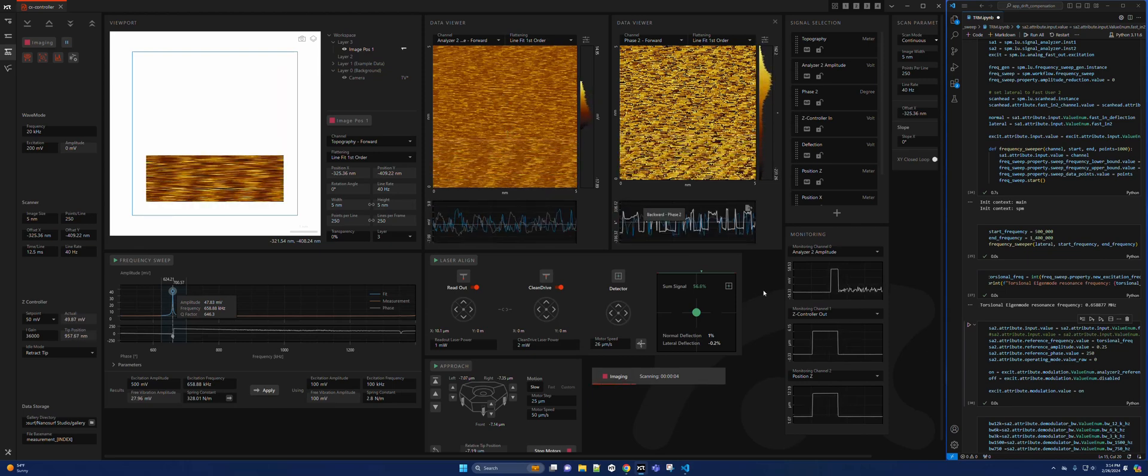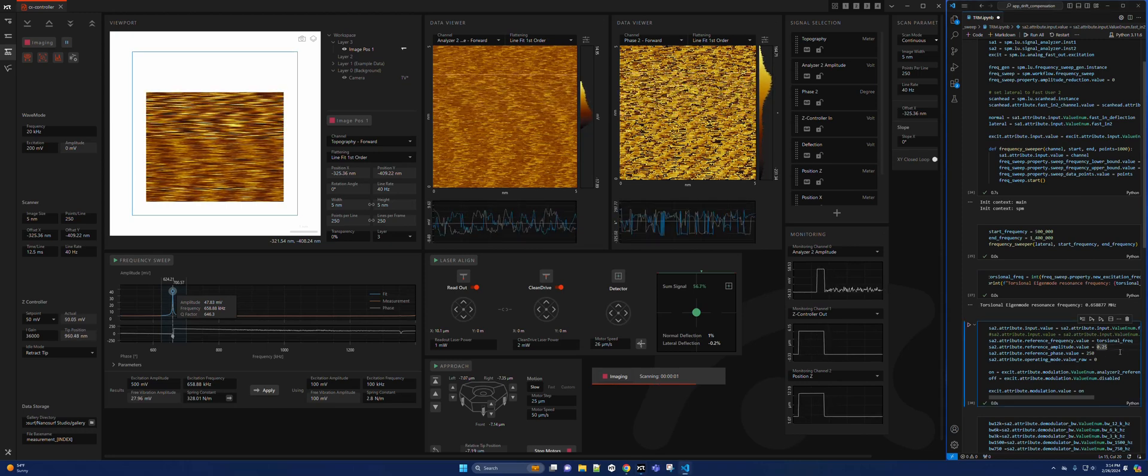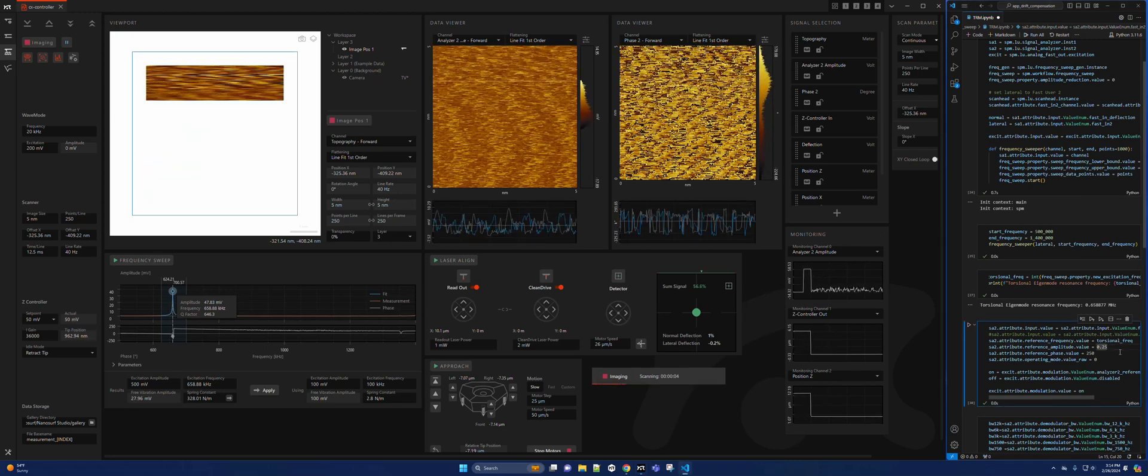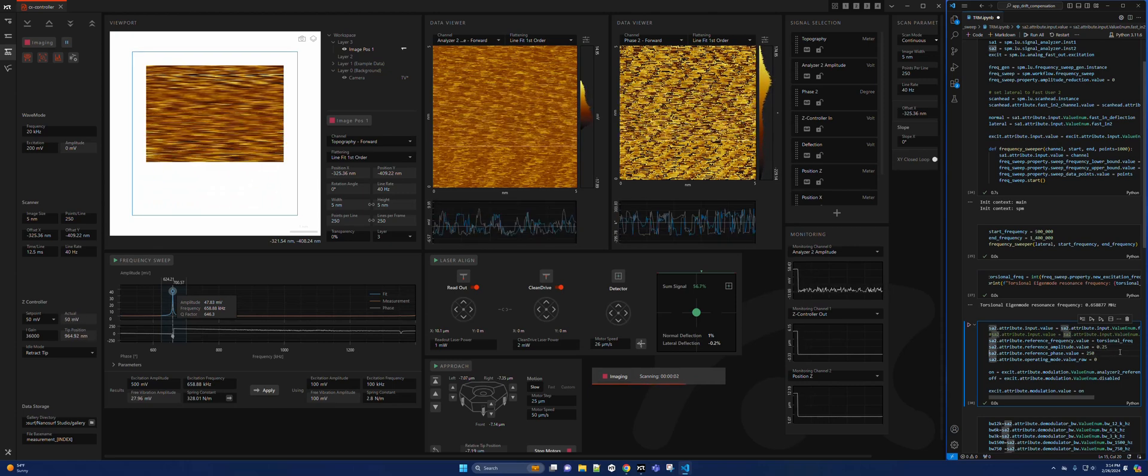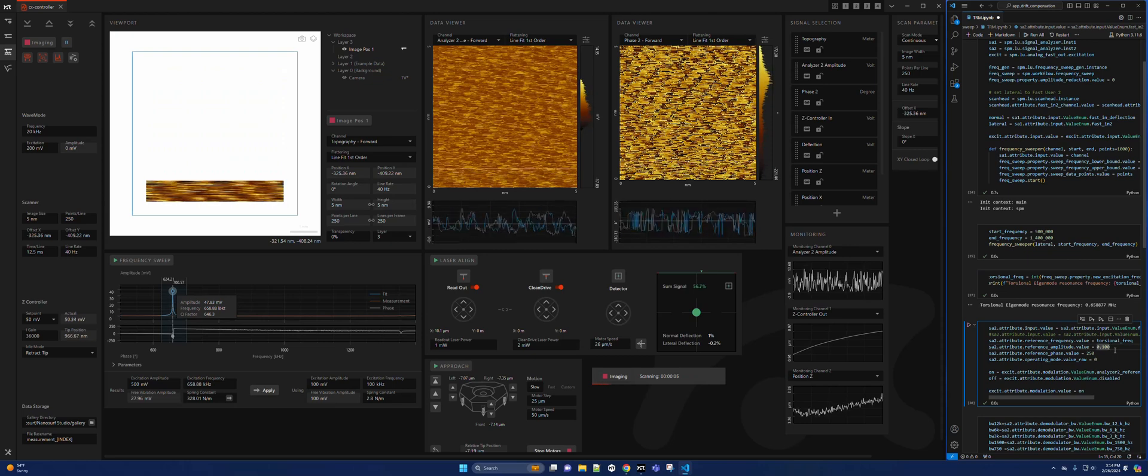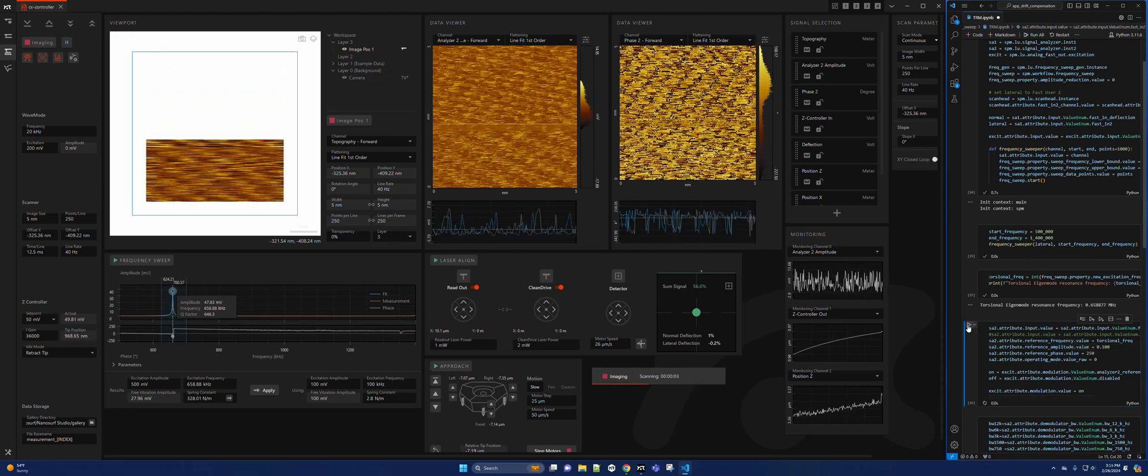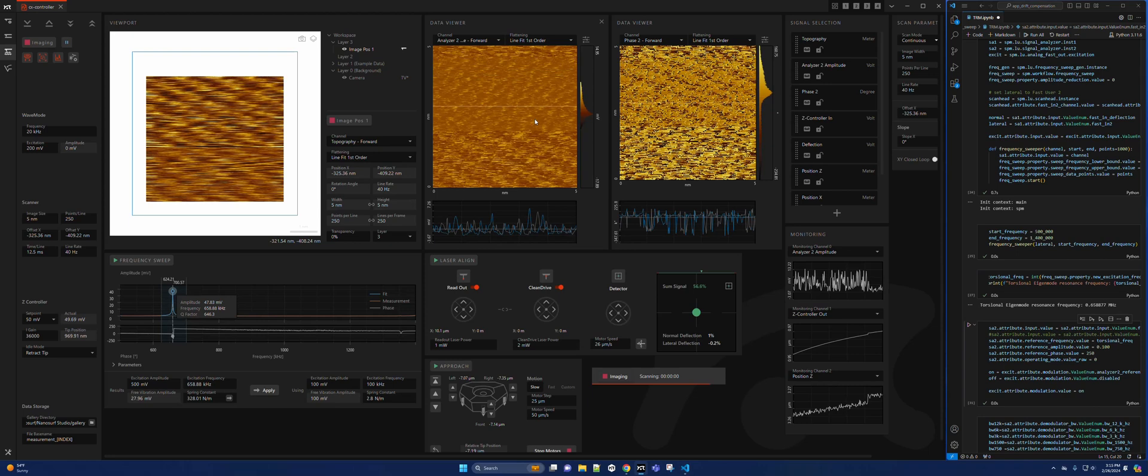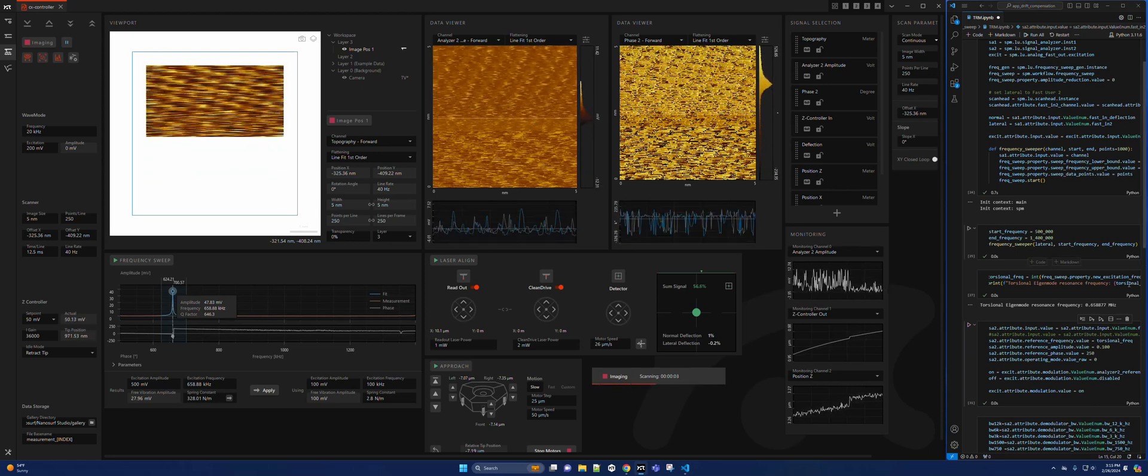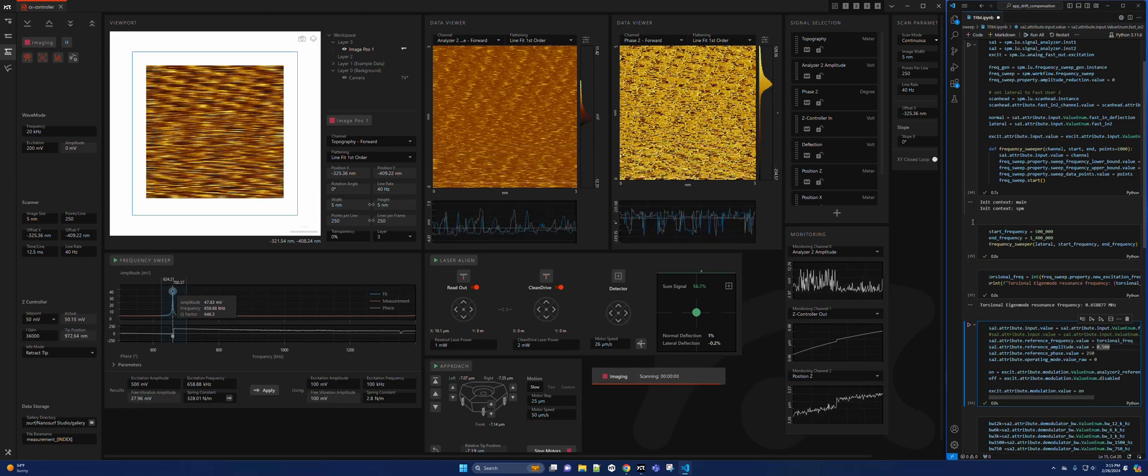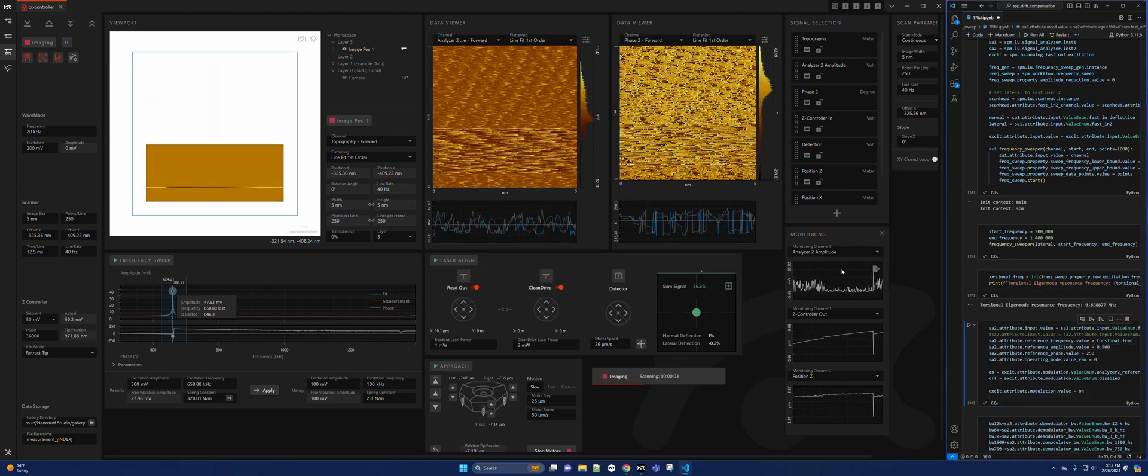Some things I can change - I can change the amplitude of the torsional resonance, the driving amplitude. I have it set now at 250 millivolts. Let's decrease it - you can see how that changes the effect here. I'm going to increase it to 500 millivolts.